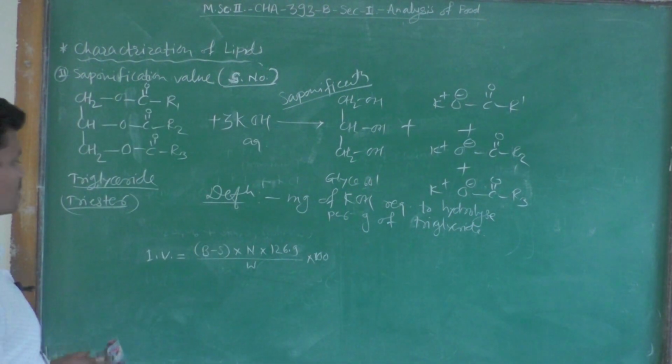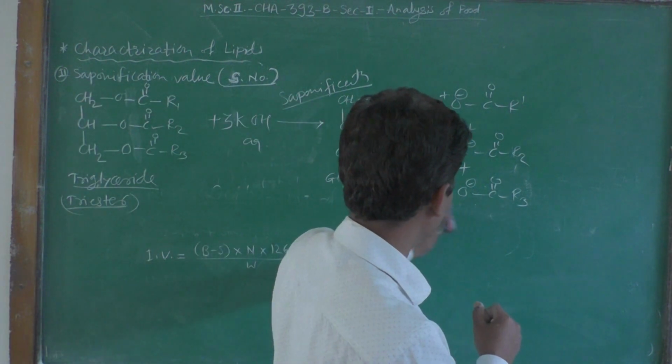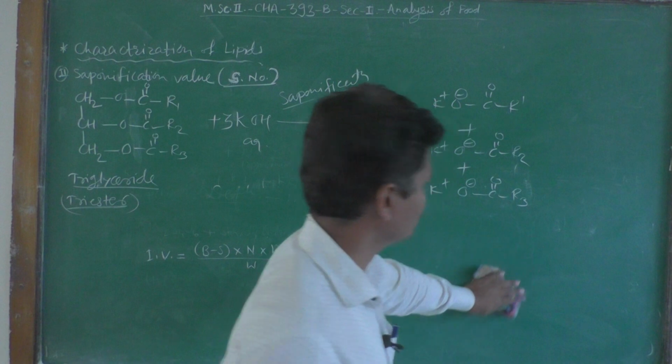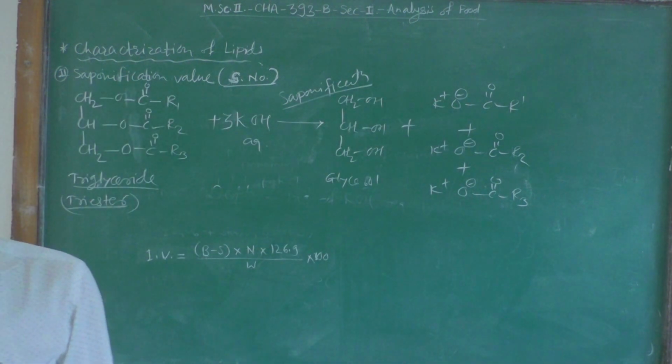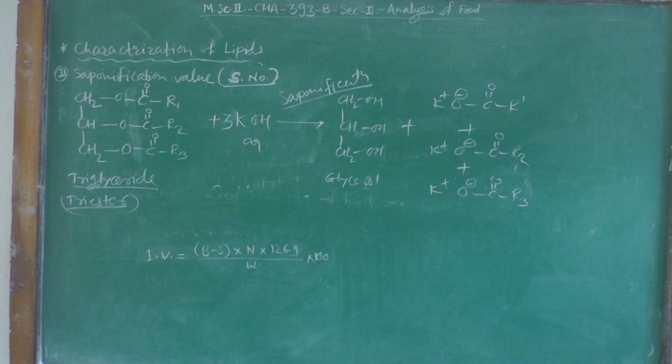Now the procedure. What is the procedure? We have an alcoholic potassium hydroxide solution.